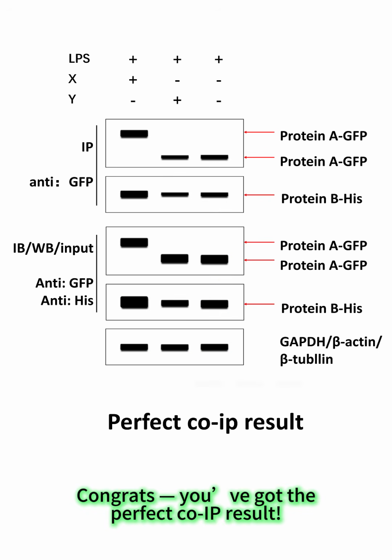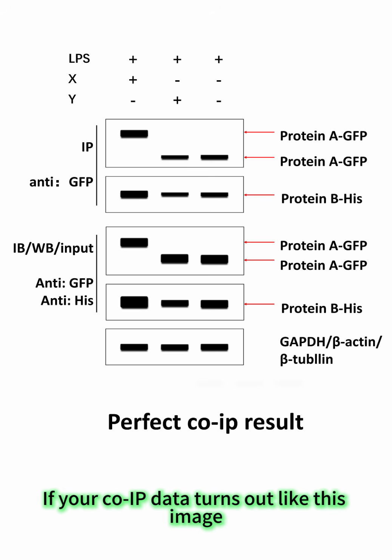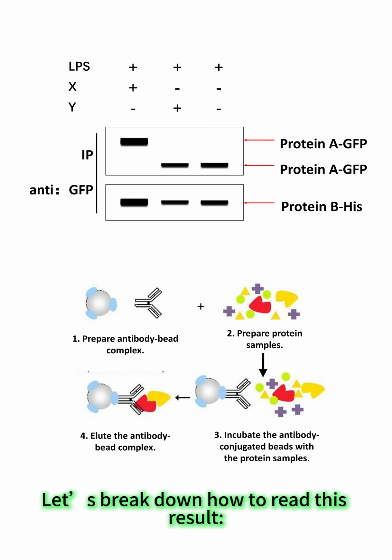Congrats, you've got the perfect co-IP result. This is what a perfect, textbook co-IP result looks like. If your co-IP data turns out like this image, then congrats, the PI in front of the screen is probably smiling already. Let's break down how to read this result.